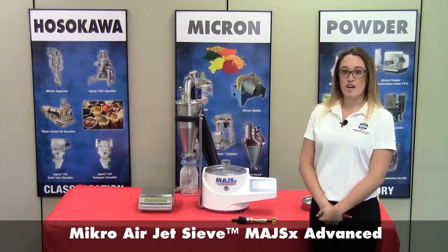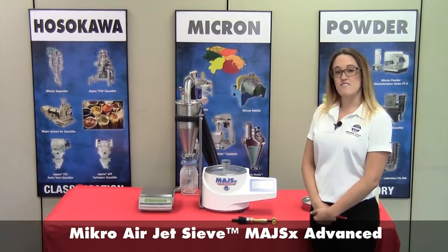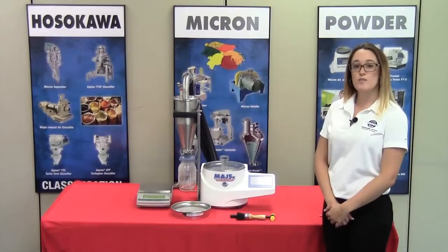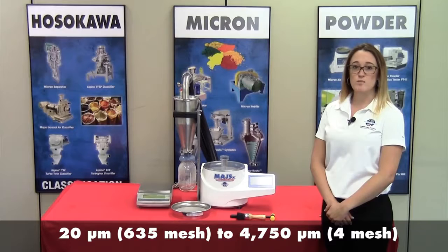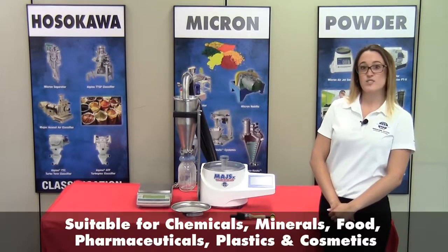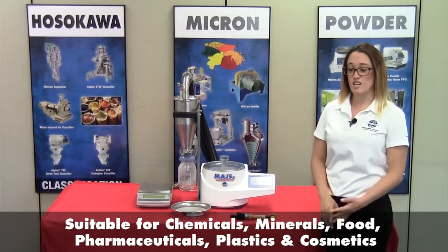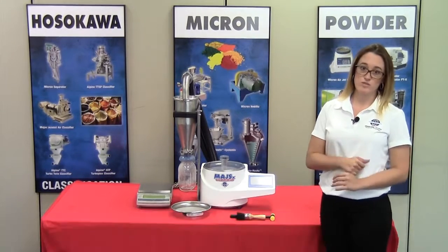Today we'll be talking about the Mikro airjet sieve MAJSx in the advanced mode. The Mikro airjet sieve is used to determine particle sizes ranging from 20 microns to 4,750 microns. It's used in application areas such as pharmaceutical, chemical, mineral, cosmetic, and food.